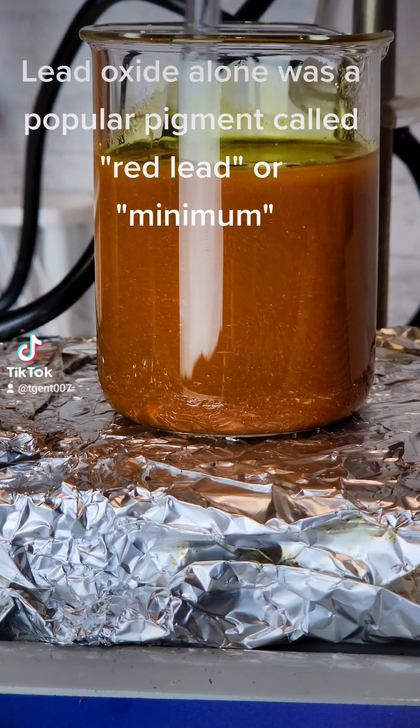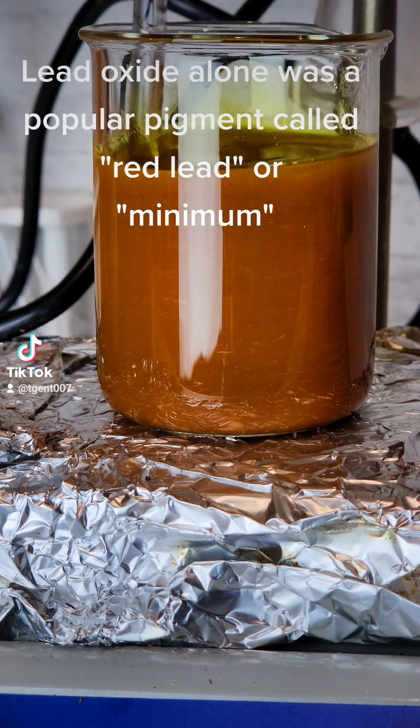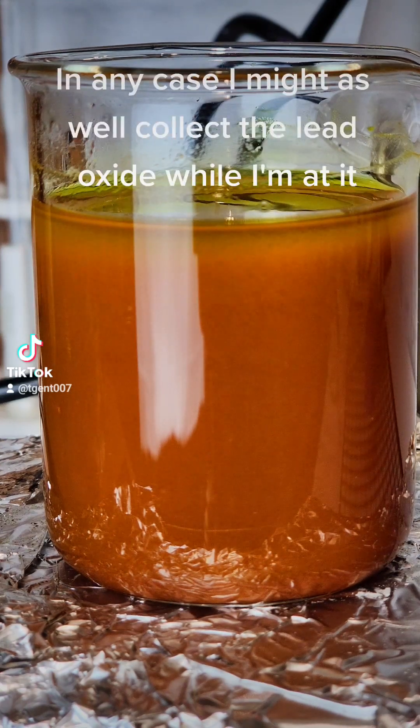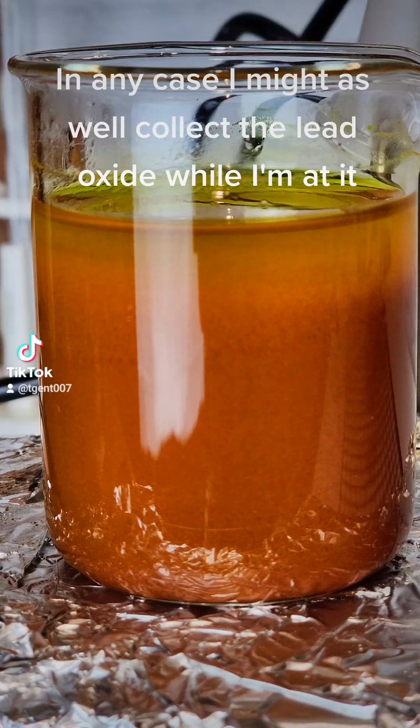Lead oxide alone was a popular pigment called red lead, or minium. Red lead was used in medieval artwork. In any case, I might as well collect the lead oxide while I'm at it.